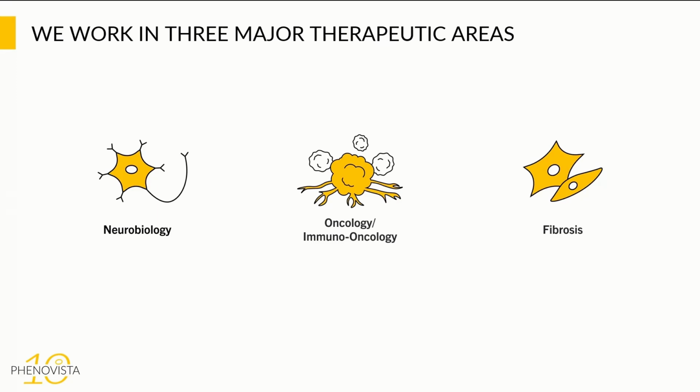They just seem to be the most popular ones that we get asked for. We've also worked in other areas like agricultural sciences, where some companies have come to us before to test maybe the neurotoxicity of a new pesticide that they want to submit for EPA approval, or maybe companies that work in animal health, so helping to develop pharmaceuticals for animals and pets. Alternative meat companies have come to us, maybe helping to figure out new culture conditions to help enrich for a certain type of nutrient. So a lot of the work that we've done has also fallen outside of these three spaces. Today, I'll be talking mostly about these three spaces and giving you examples within each of these.